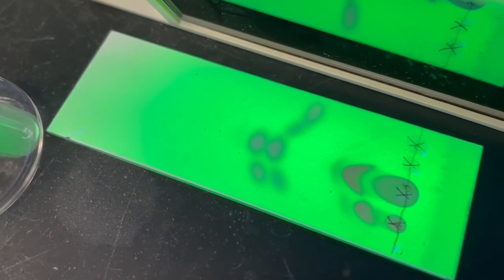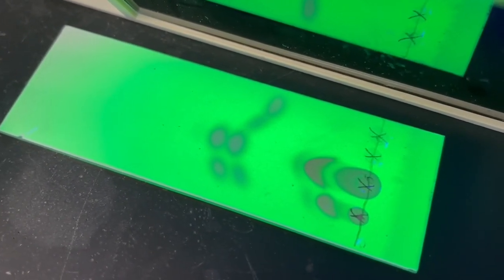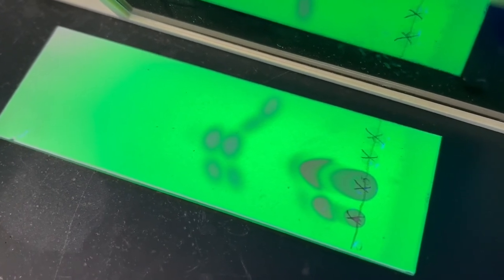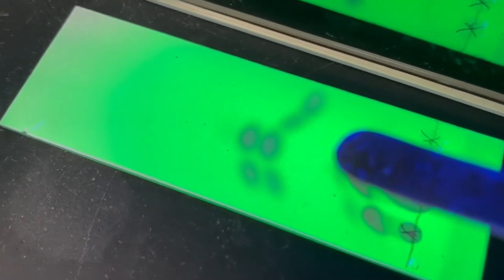So when you're trying to determine the RF value for these things, let's go ahead and use the bottom one. So like this one right here and that one right there, and then that one right there, because those are actually equal, right? So those are the RF values for that particular trans product, and that's for the cis trans product, and then the triphenylphosphine oxide will be this bottom one as well.